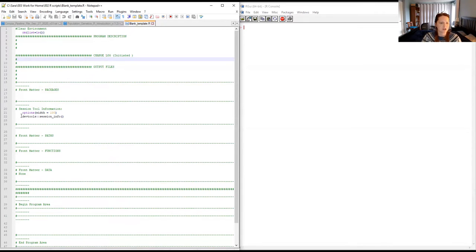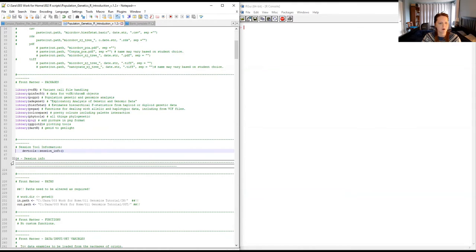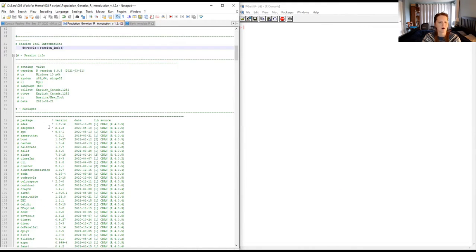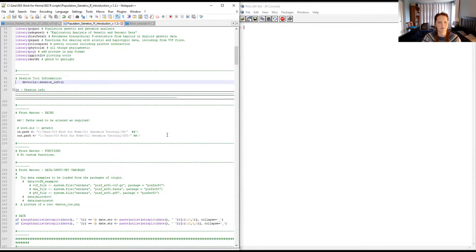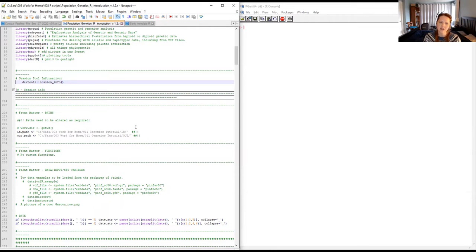I'd also like to draw your attention to the devtools session_info command. This prints out all the information about your R version and all the package versions. This can be helpful if you come back to your program after R or packages have been updated — there could be changes under the hood you don't know about. If you get a different answer when you run your analysis, this is the information you'll need to isolate whether a package change was responsible. It's good to save that session info when you submit your paper to the journal.